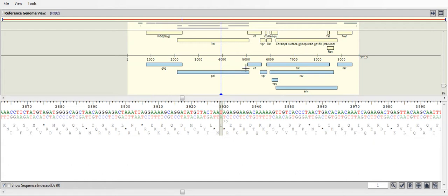The genes are represented by the blue bars within the gene panel. The panel above, displaying the yellow bars, is called the feature focus panel. Any type of feature, apart from genes, can be selected and represented as yellow bars. At present, the coding sequences, or products, are selected as the feature focus. The coding sequences are always selected by default.